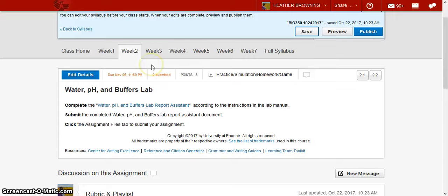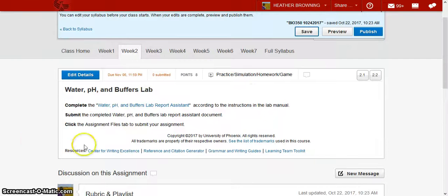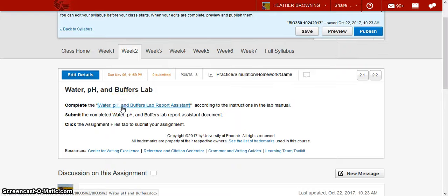Hey y'all, this is the walkthrough for the week 2 lab, water pH buffers lab, and basically you'll see up here the directions, which are kind of vague. Click on this, it will give you those instructions and the whole Word document. I could do that to show you. You saw that in week 1, but let's just do it for kicks.